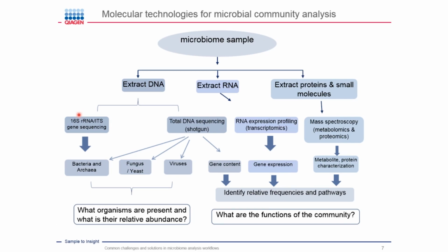The beauty of 16S sequencing is that you have a short amplicon, which is normally something like 300 base pairs when you look at the V3, V4 region, but still has a high discriminative power. So you can sequence this at a low sequencing cost in the end, sequence a lot of samples, and get your bacterial diversity, so your OTUs and the composition in your sample.